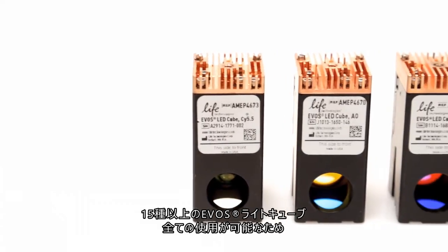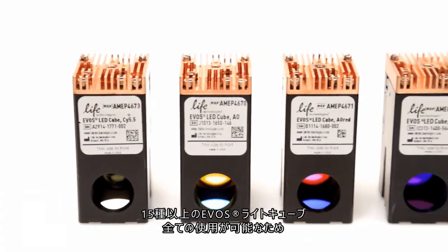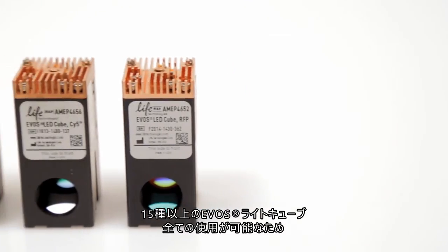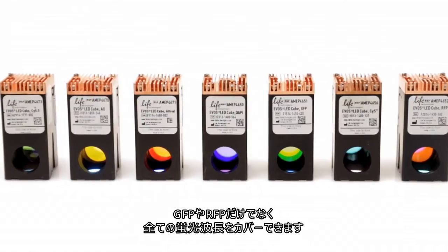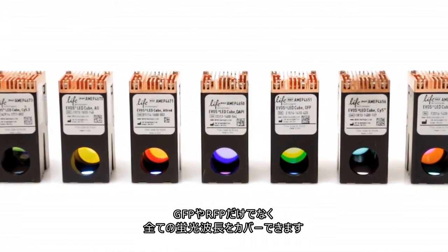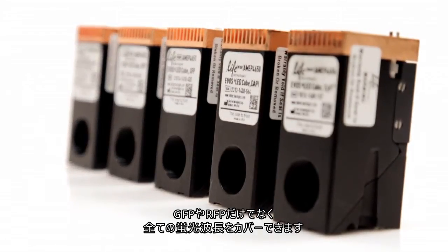Since it utilizes the full range of EVOS light cubes, the Countess2 FL cell counter is not limited to detecting GFP and RFP fluorescence. Over 15 light cubes are available to detect a full range of fluorescence depending on experimental applications.